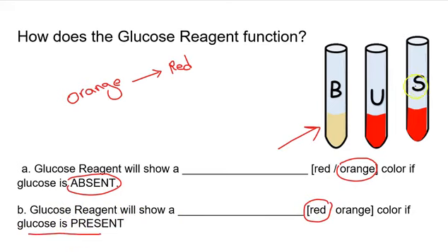So we knew that our standard glucose solution has glucose inside, but we did not know whether we have glucose inside of our unknown glucose solution. It means yes, we have glucose inside of this.